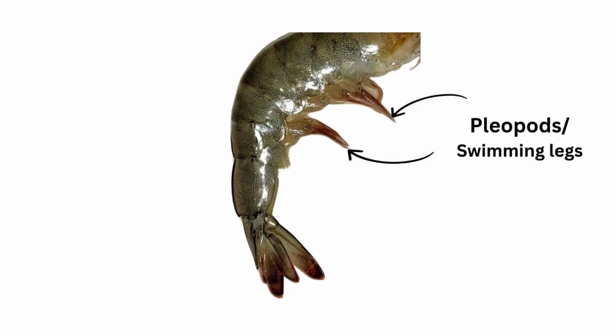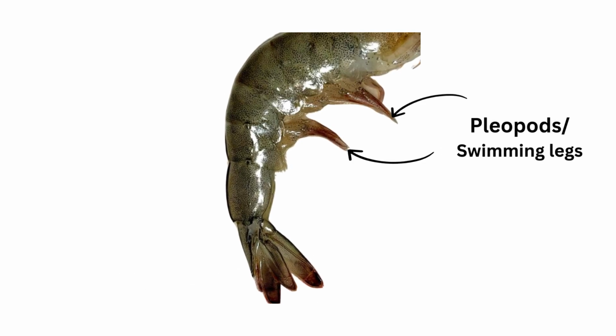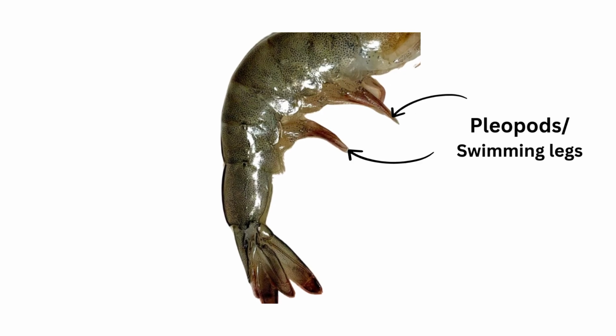Pleopods, also known as swimmerets. Pleopods are small paired appendages located on the underside of the abdomen. Shrimp typically have 5 pairs. They are used for swimming, maintaining balance, and in females, carrying and aerating eggs.